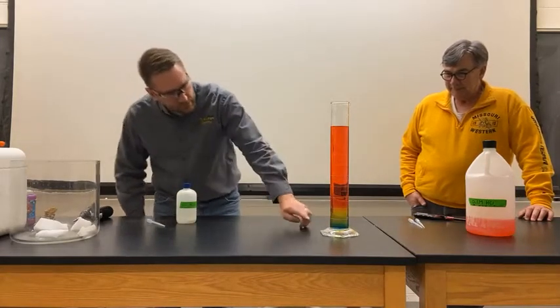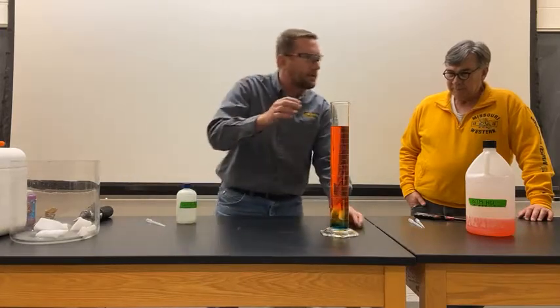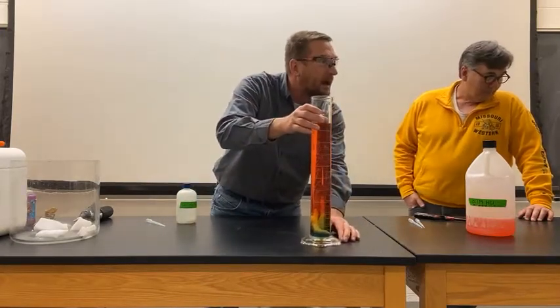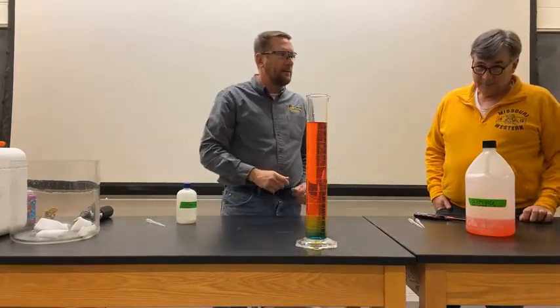So you can start to see the color change associated with the universal indicator. Gosh, I hope you guys can see that in our Facebook live feed.